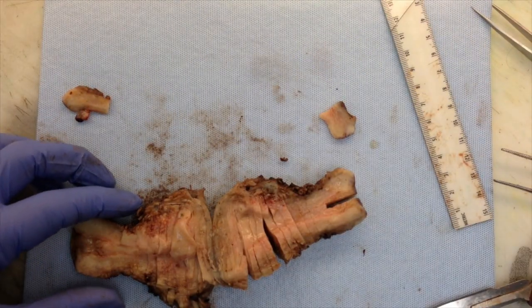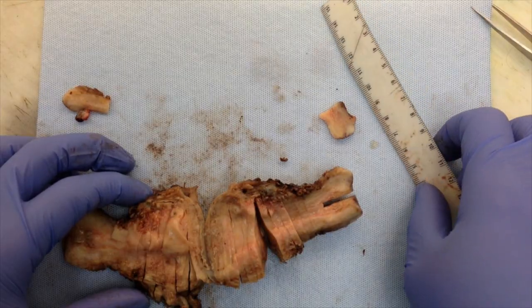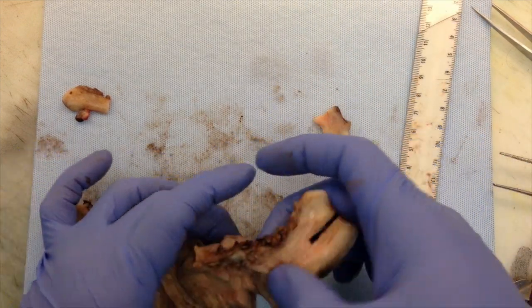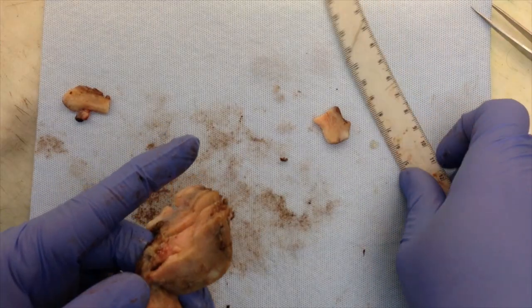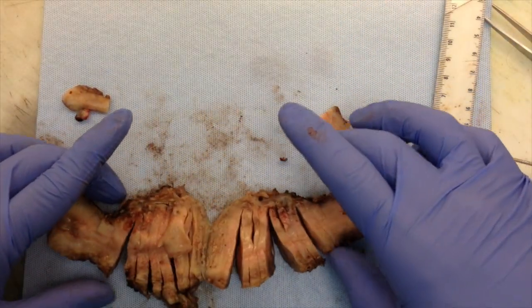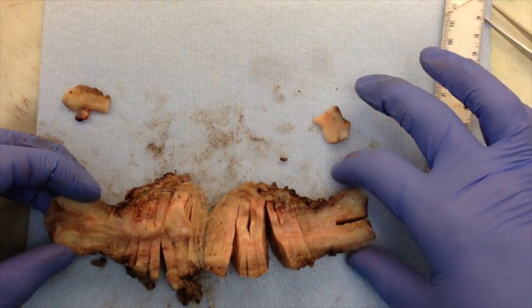The endometrium (0.1 cm in average thickness) is tan, smooth, and glistening. The myometrium (1.6 cm in maximum thickness) is tan, slightly trabeculated, and remarkable for multiple tan-white whorled intramural nodules ranging from 0.5 to 1.1 cm in greatest dimension. None of the intramural or subserosal nodules demonstrates any hemorrhage or necrosis. The endocervical canal is chevron shaped and unremarkable.